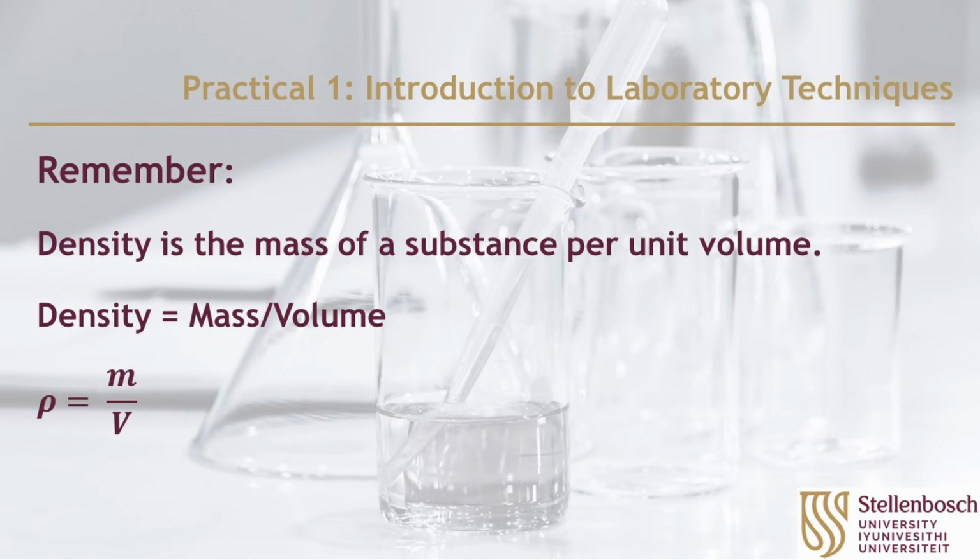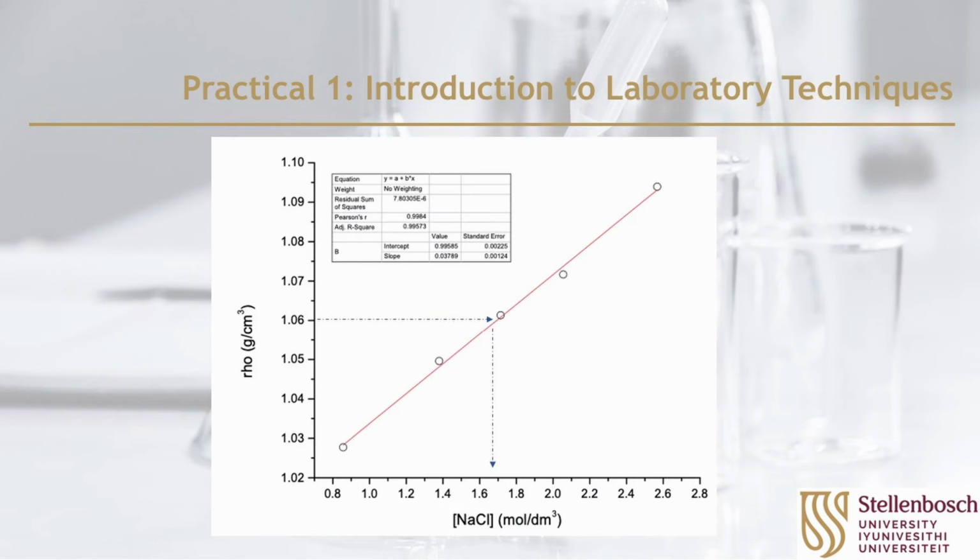Remember, density is the mass of a substance per unit volume. The density value of the unknown sodium chloride solution can then be used to identify the concentration of the sodium chloride solution according to the calibration curve.